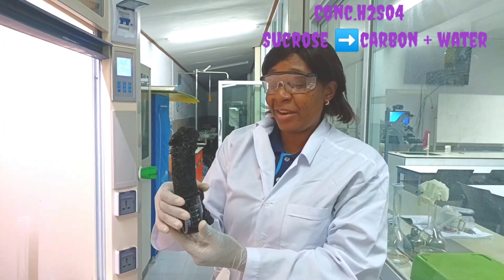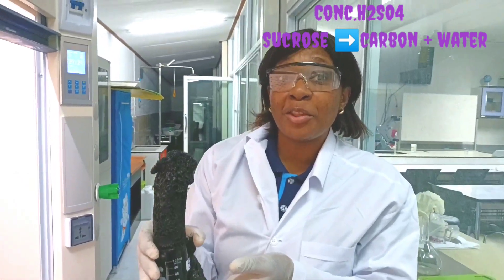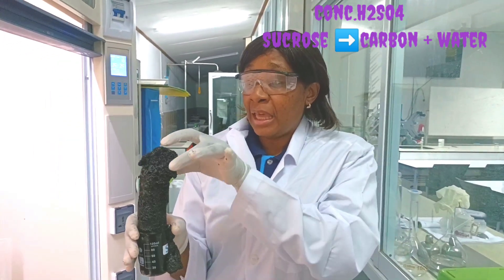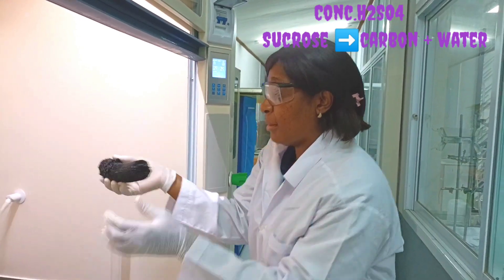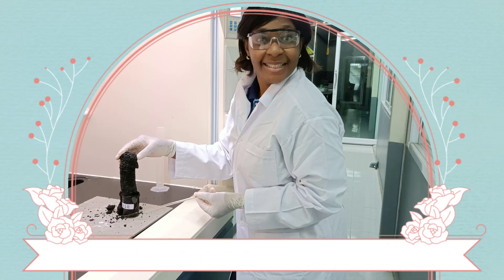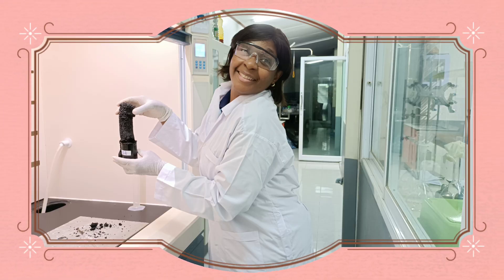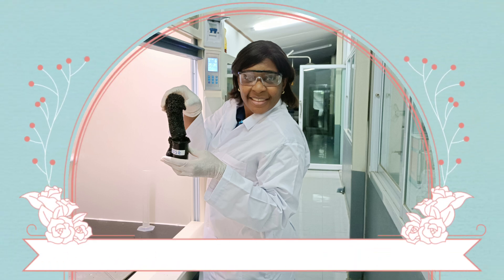Here is my carbon snake — this is what was formed from the reaction between concentrated sulfuric acid and sucrose. You can see it forms this black substance which looks like coal. Look at the texture — see how it breaks apart.